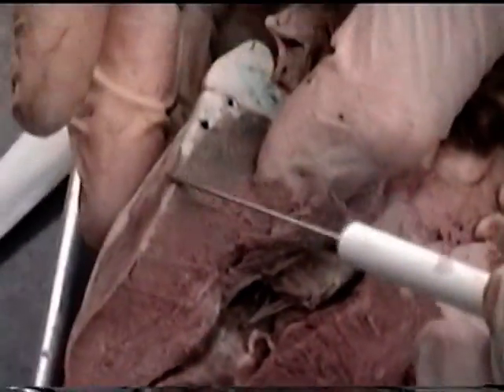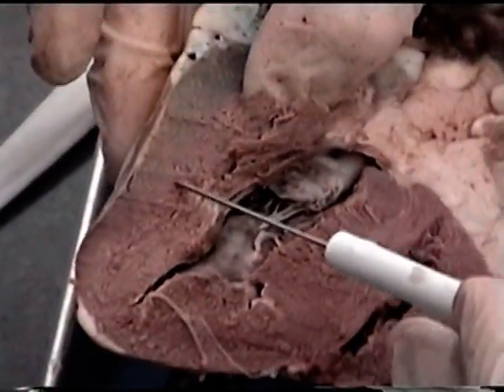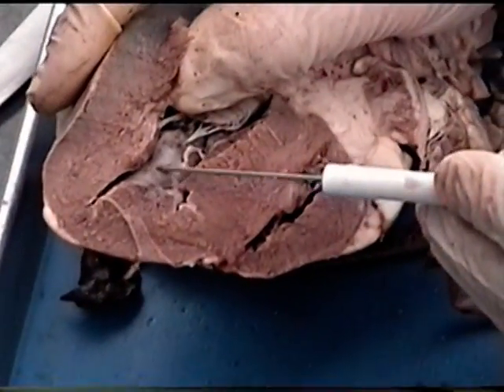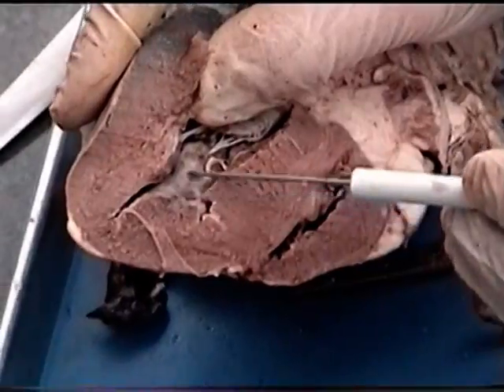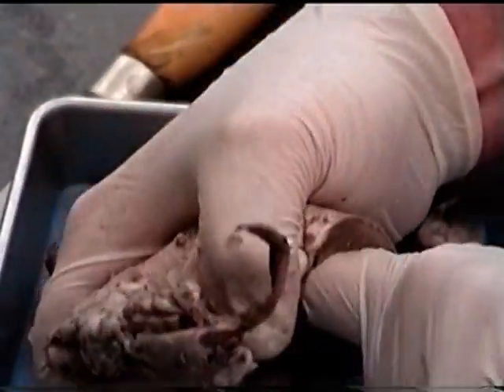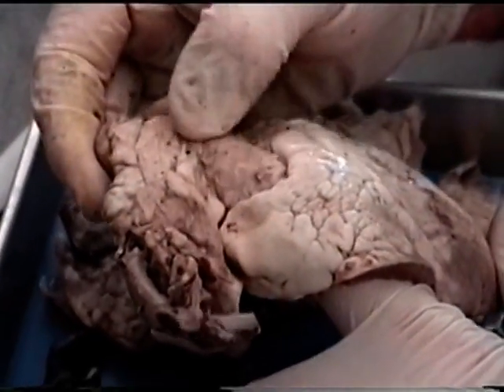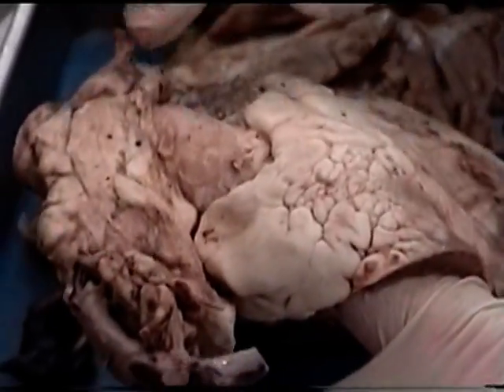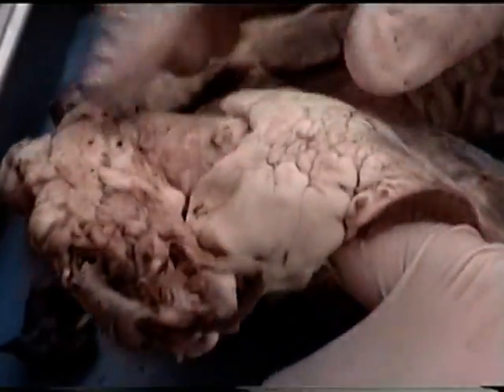And then we can see the epicardium of the heart here, the myocardium of the heart here, and then this shiny surface on the inside of the heart is the endocardium, so we can see the layers of the heart itself. So if I put my finger through here from the right side, then my finger now is in this blood vessel. So that confirms what we originally thought, which was that this was the pulmonary trunk, and it's the major vessel coming out of the right ventricle of the heart.